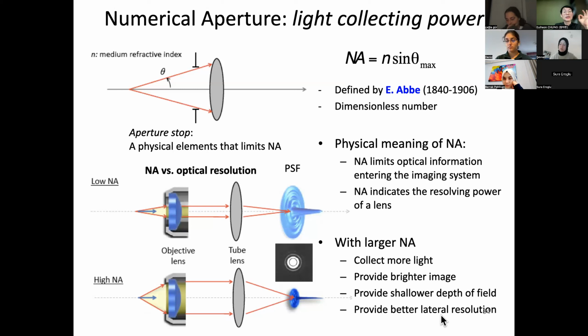At the same time, you will have a nice blurring effect on the out-of-focus regions that you guys know. So high NA will focus very well, but it blurs out-of-focus regions. So for us, a very aesthetic effect can be expected too.